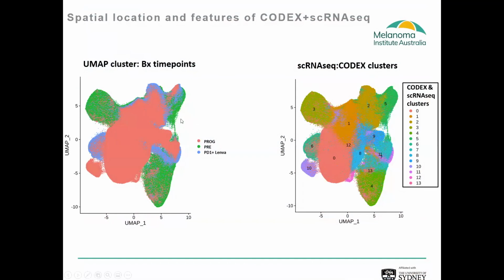Cam was then able to cluster the cells. So we have, in 7 biopsies, we accumulated over 2 million cells. So this is a huge number of cells to process and analyze, and Cam was able to perform unsupervised clustering of the different biopsies from this interesting patient.